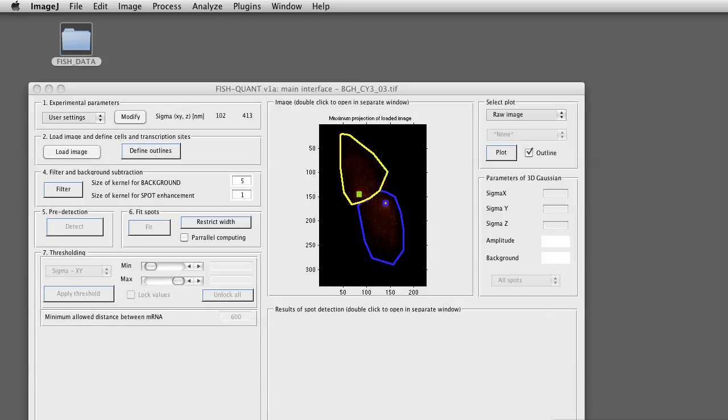quantification. Here we need two files. The first, the averaged image of the individual mRNA molecules. The second, the summary file for all the estimated parameters for those mRNAs. We generated those files earlier in the tutorial on the batch processing of the mature mRNA.